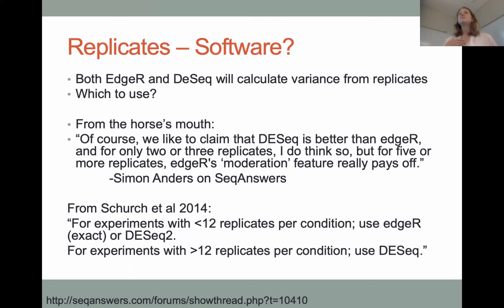Very few. Very, very few. Yeah, but prices are coming down. It's getting easier. We've gone from paying $400 an RNA-seq library to more like $200 just in the past 4 or 5 years. So the prices have gone down by half. I don't think they're going to go down anymore. I think we're kind of at a plateau until a new sequencing technology comes out.